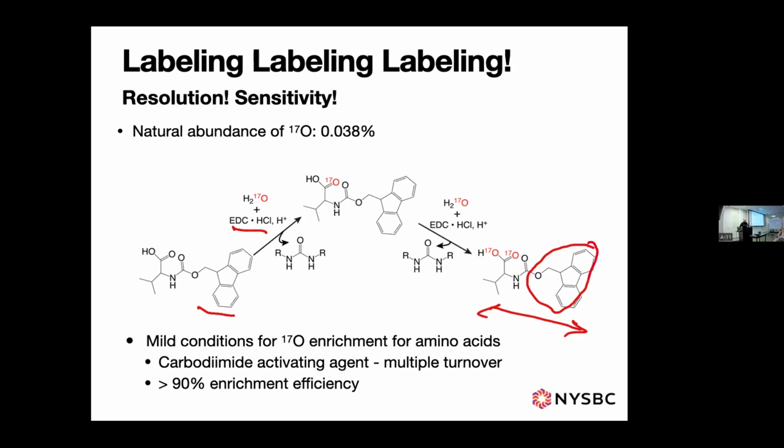Thinking about the carbon database, which is different in terms of the point of view of the measurement, there you could really distinguish different kinds of anions for different kinds of protonated states. But for the anion here, do you think there may be oxygen exchange? So even if in principle there were a different environment, you're not going to see it? Because normally the environments are pretty different from the point of view of the carbon.